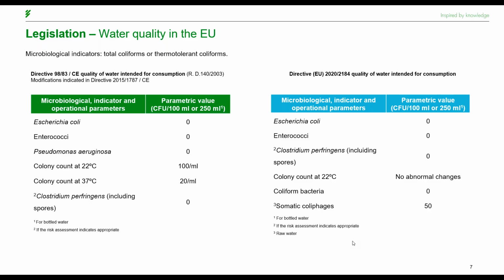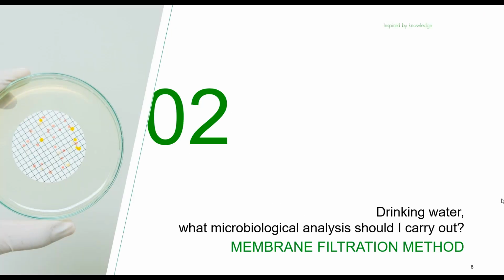These have been proposed as a more reliable indicator than, for example, enteric bacteria. For these reasons: their persistence is greater in the environment, they reproduce in a controlled way in the presence, of course, of E. coli host cells, and their resistance to the physical and chemical treatments currently used. So those are the three main points that are the reason these have been deemed a very reliable indicator.